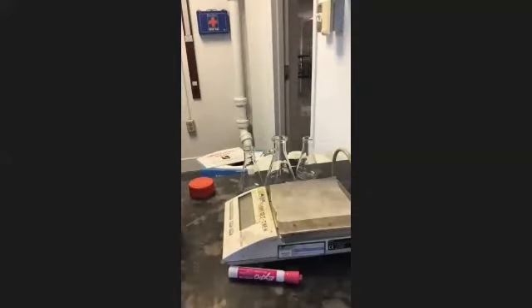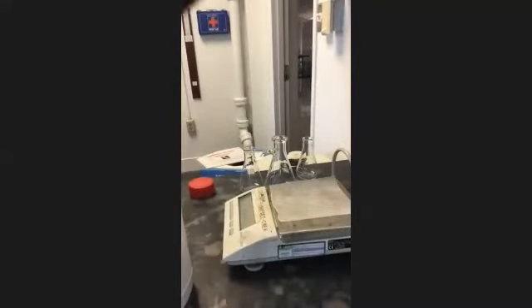I'm just gonna do it. So we got a piece of wax paper on the balance. Normally we'll take a weigh boat, but weigh boats are very expensive. You can get a whole roll of wax paper for $5, and I've had this for like 4 years. And we're gonna weigh out 6.9 grams. Put that in the required amount box, 6.9 grams. And then for acetic anhydride, we're gonna do 7 milliliters.